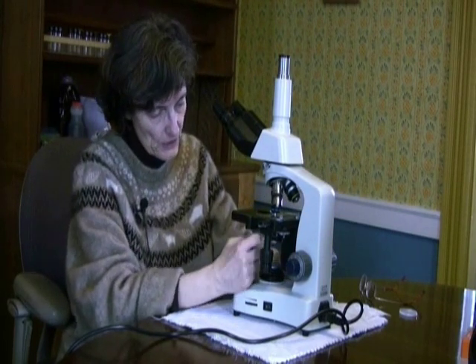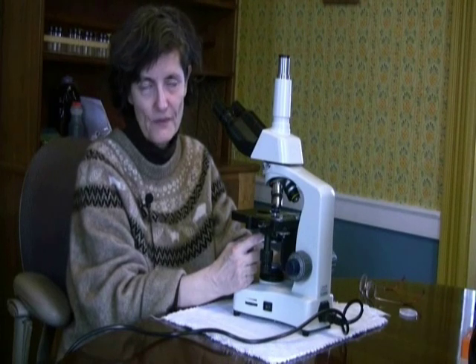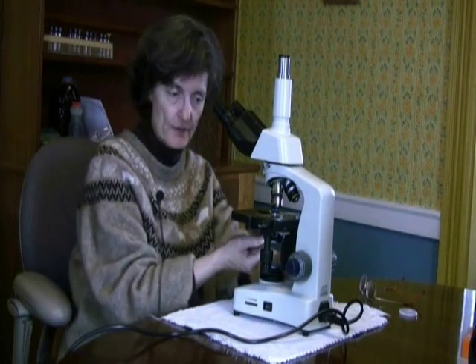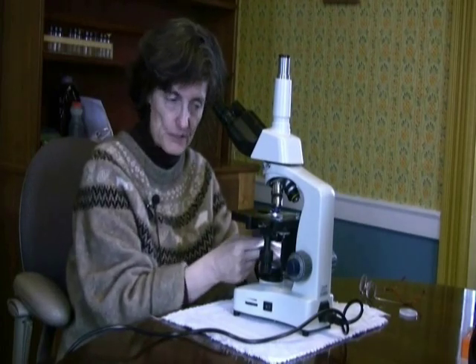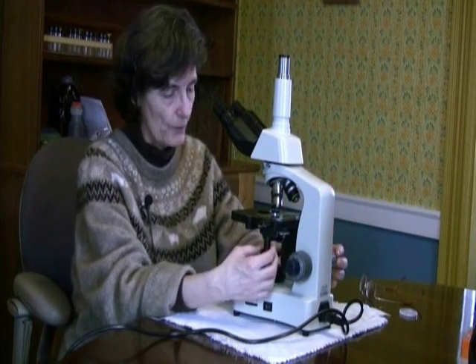The next thing that you have to have is an ABBE condenser. It's a German word, and the acronym is ABBE condenser, numerical aperture of 1.25, a minimum numerical aperture of 1.25. It should therefore have an iris diaphragm on it that you can use to shadow the organisms that you're looking at so you can bring them into better resolution. Your eyes will be able to see your organisms better if you get that shadowing effect going on.